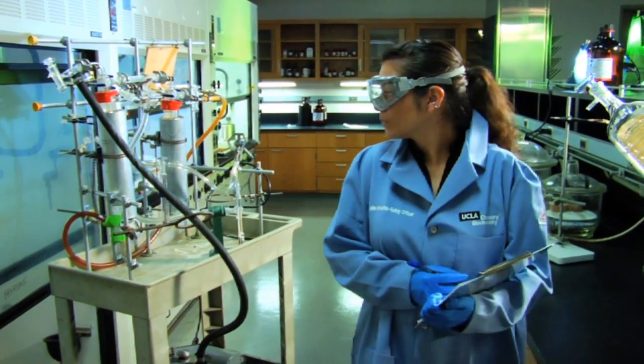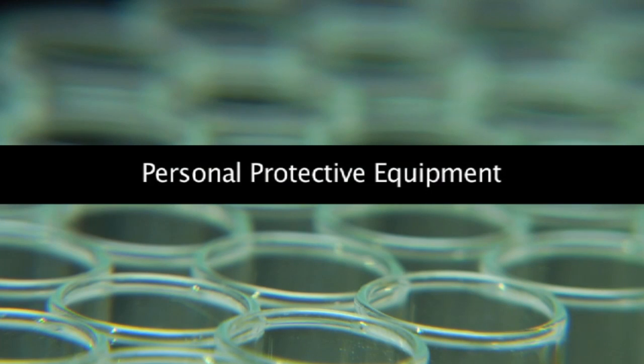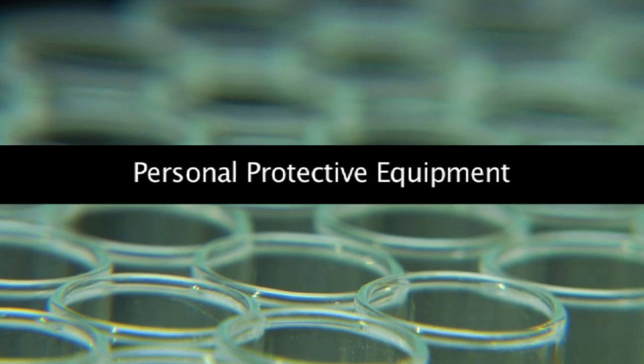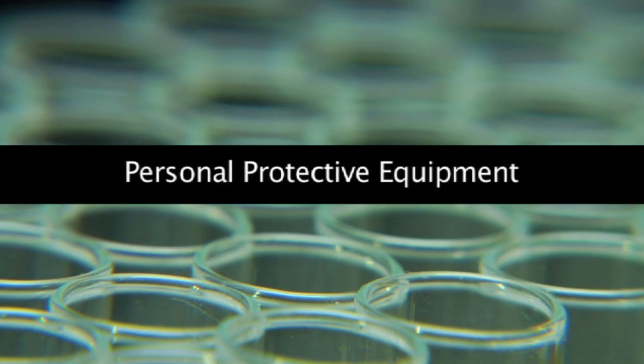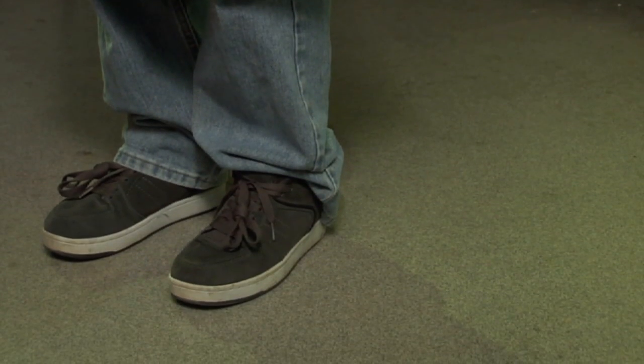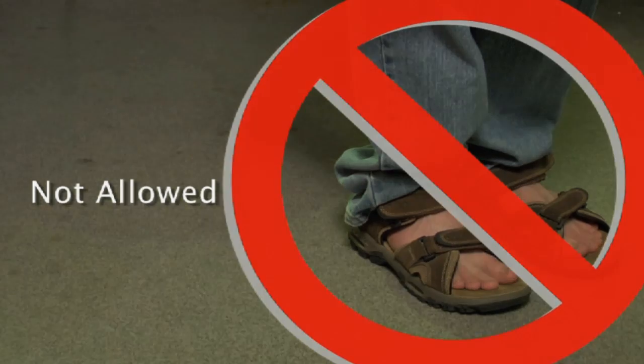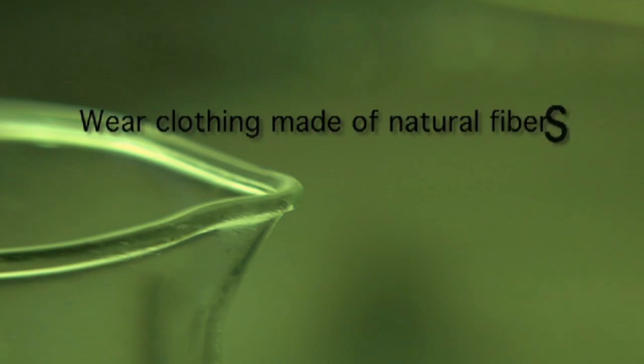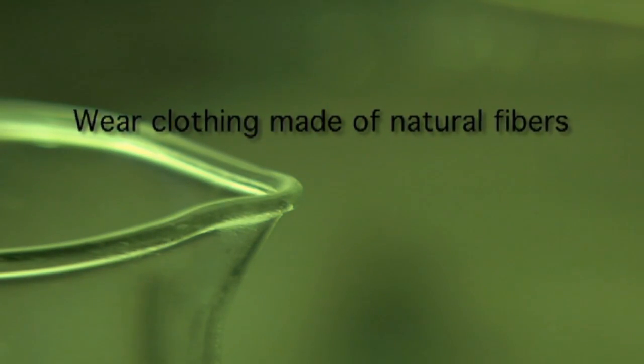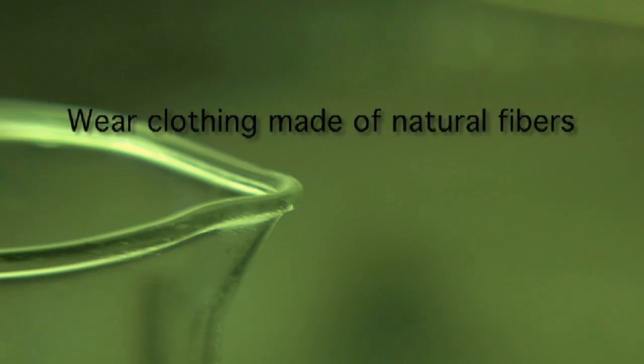In addition to recognizing hazards and evaluating your laboratory, you must take steps to protect yourself. Personal protective equipment, often called PPE, is key to ensuring your personal safety. This starts with your clothing. Anyone entering a laboratory must wear full-length pants and closed-toed shoes. No flip-flops or other open-toed shoes are permitted. We also recommend that your clothing be made of natural fibers, such as cotton, because these materials offer better protection in the event of a fire.